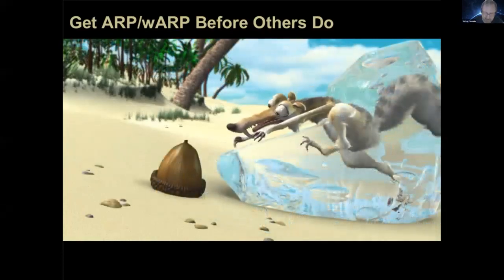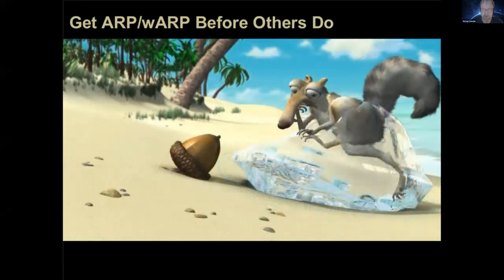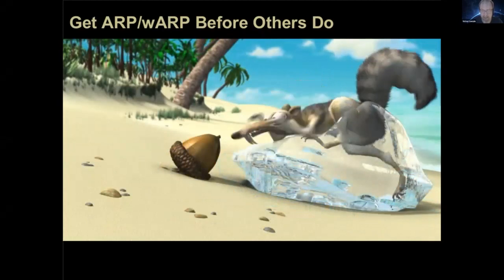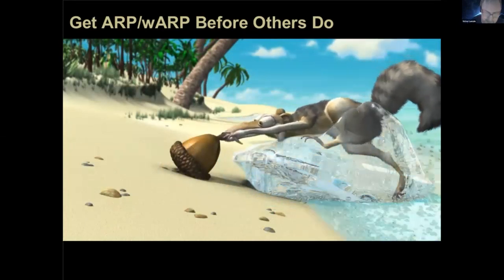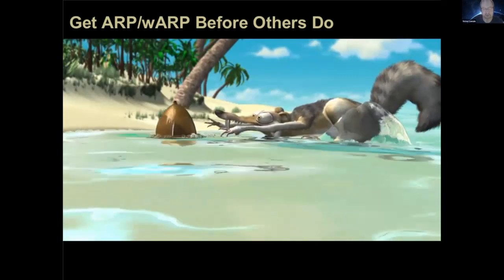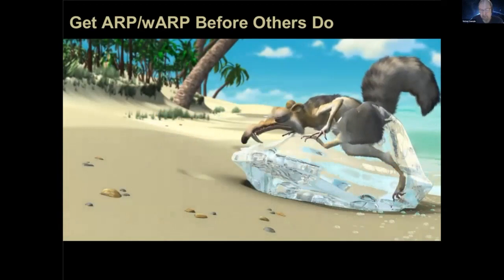He was continuing to try hard, with not very much success, thinking a lot, thinking of applying different methods, really trying his best. The structure was really difficult to determine. This is the effect of solvent flattening, which you could see also did not help very much. And the question obviously arises.